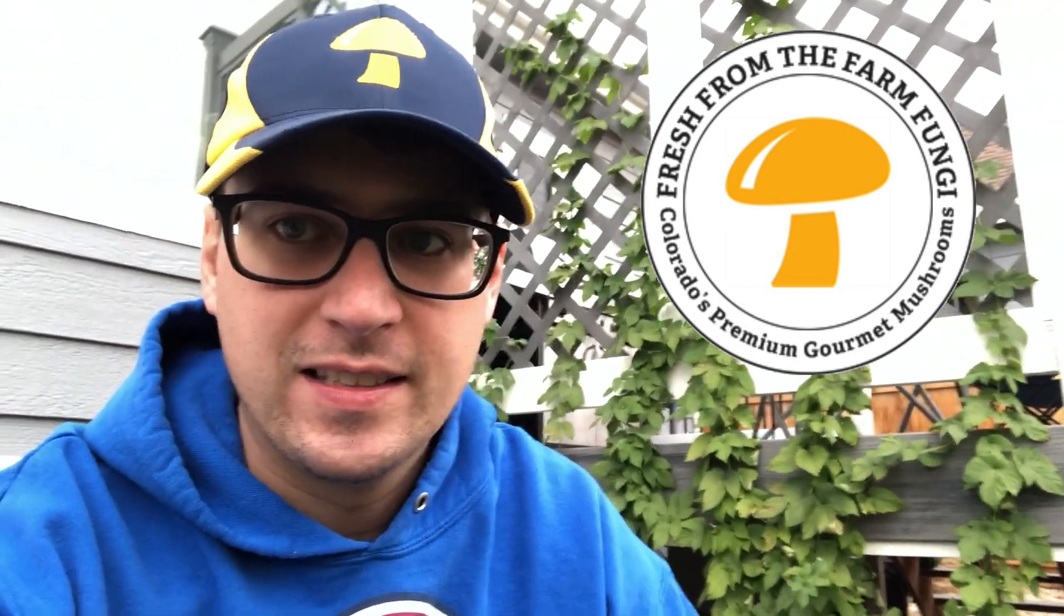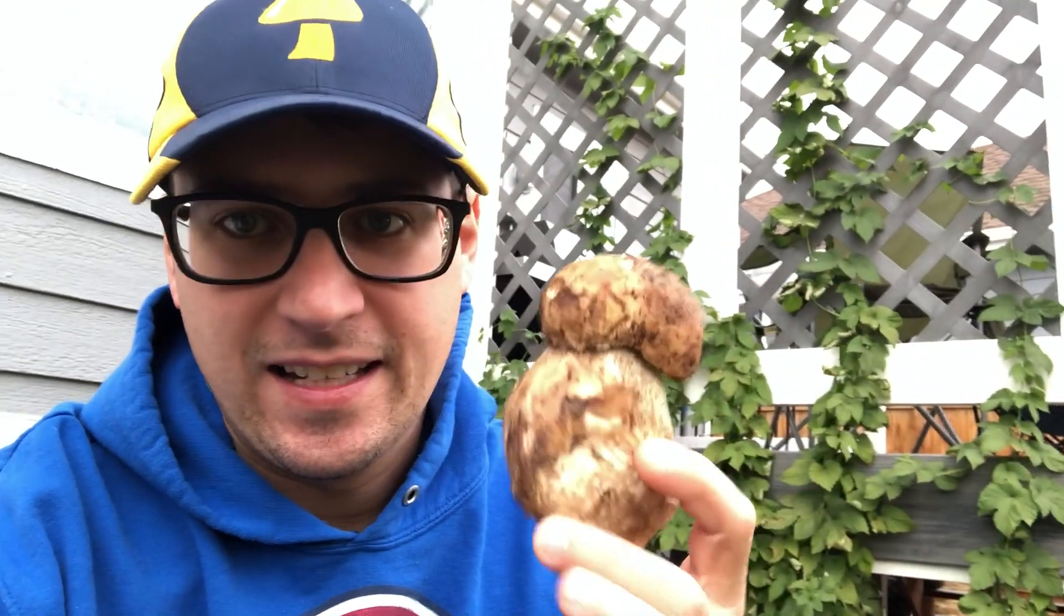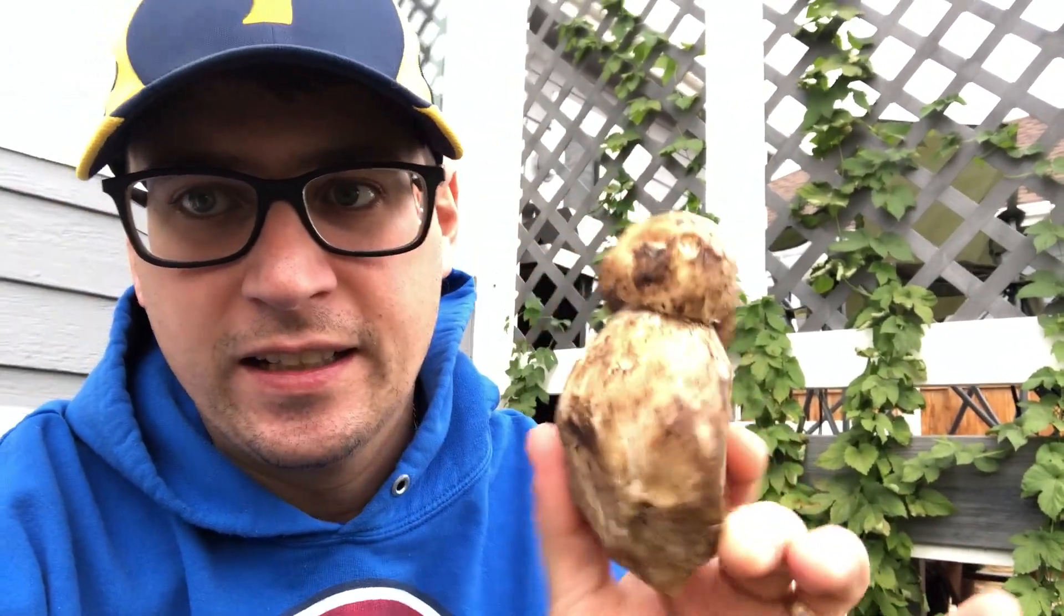What's up guys, it's Gary with Fresh from the Farm Fungi. I'm here in Denver, Colorado on this pretty chilly mid-October day, and today I wanted to clone a porcini. This is a Boletus edulis.